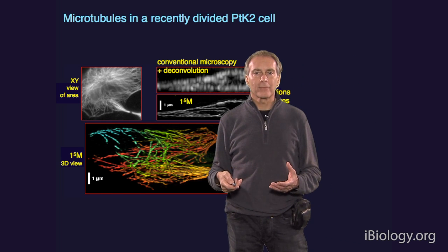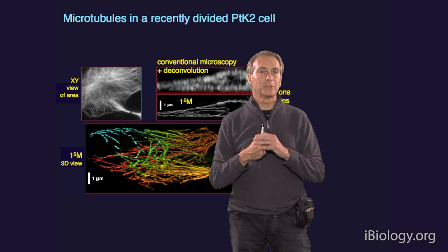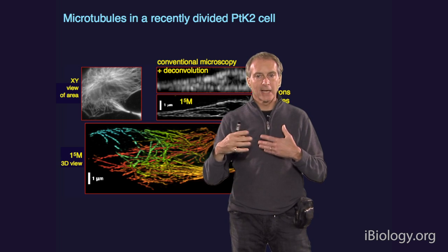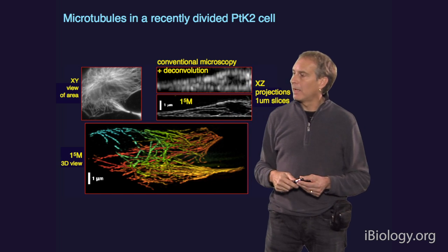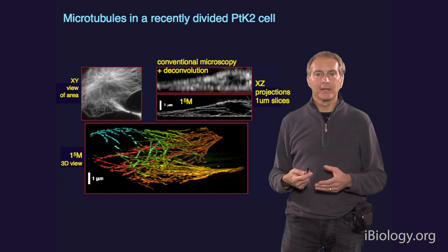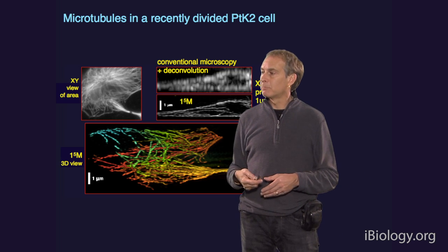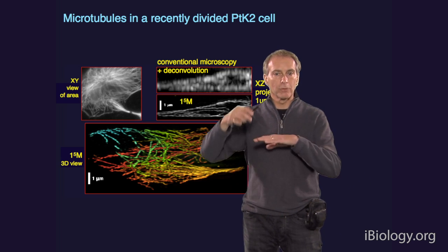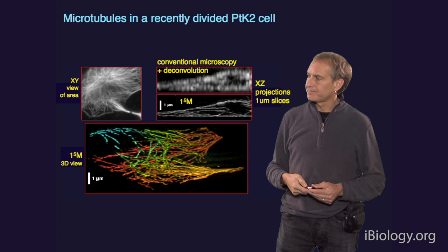The drawback from it is that you actually need to have your sample wedged in between two objective lenses, and everything has to be perfectly matched, and the path lengths have to be very tightly controlled. And so it's an experimental nightmare at times, but the results are really quite extraordinary. And it's much more sensitive because, again, you collect all the light from both sides, and you get to utilize that in making the image.